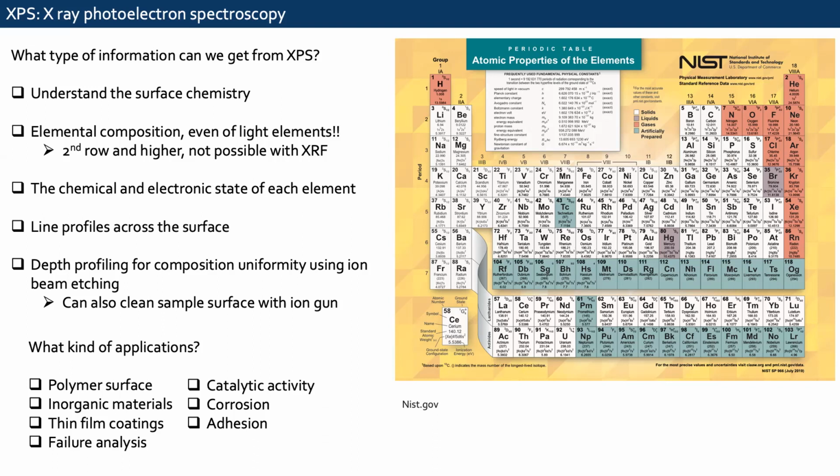So usually when you prepare any sample, you're going to have, it's called, I always forget, advantageous carbon. Rebecca, am I right? It's like adventitious. Adventitious carbon. It just means atmospheric carbon. So I don't know why they don't call it that.